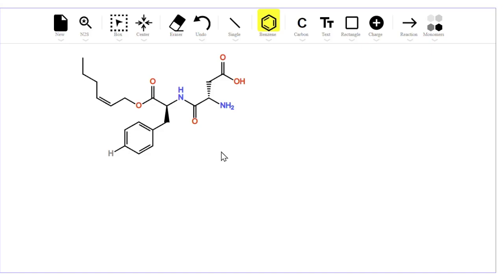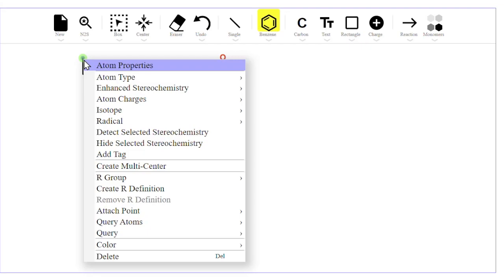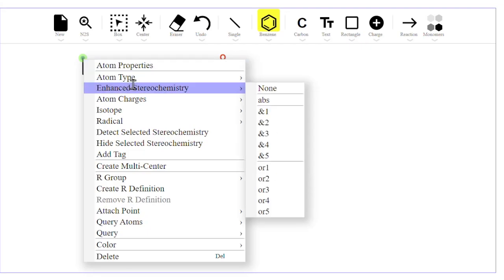For example, Ctrl-C for copy, Ctrl-V for paste, Ctrl-Z for undo, etc. You can find out these keyboard shortcuts by looking at the contextual menus. For example, if I point my cursor at an atom here and right click, I get a contextual menu.